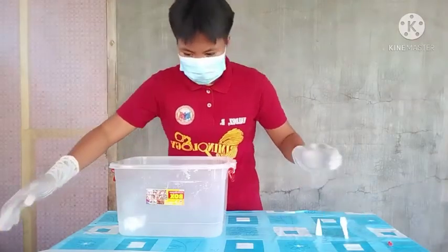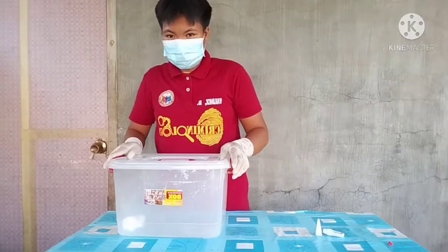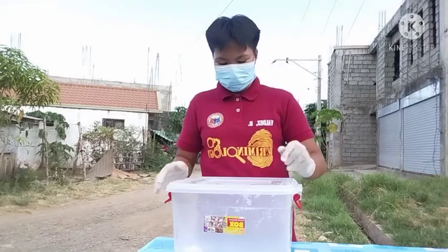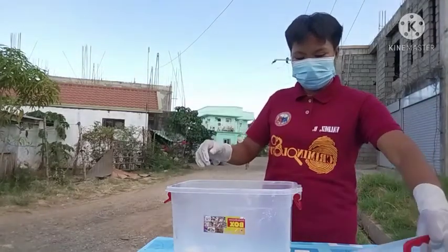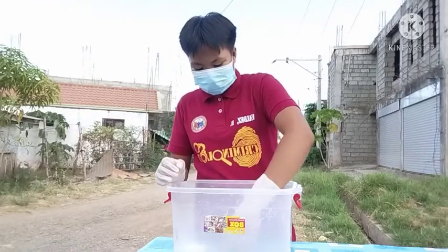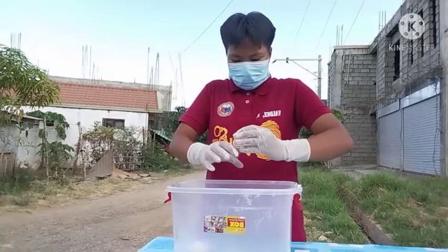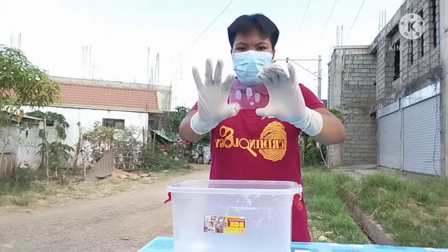After that, we need to close it properly and wait for 20 minutes before we open it. 20 minutes is already done and we will open it and see the result of this method. I will pick the plastic card which has a visible print present — be careful when picking it. And as you can see, a visible print is now present using this method.